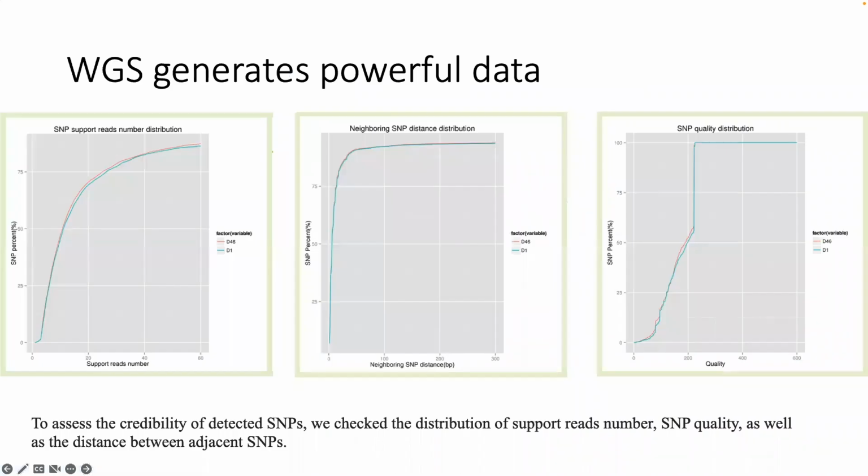And this is what some of that readout might look like. When we sequence and look at our SNPs, it's important to confirm the quality of those SNPs. And so whatever bioinformatics pipeline you choose to use, you should get some readout that looks at the quality of your SNPs in the sample that you actually get off of the sequencer. Validate before you move forward with that finding.